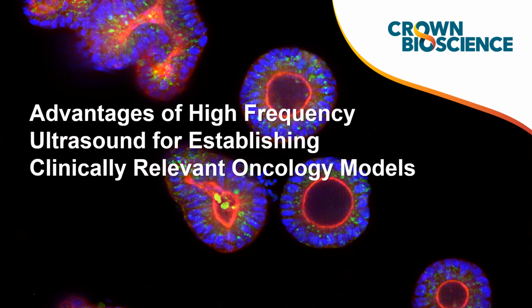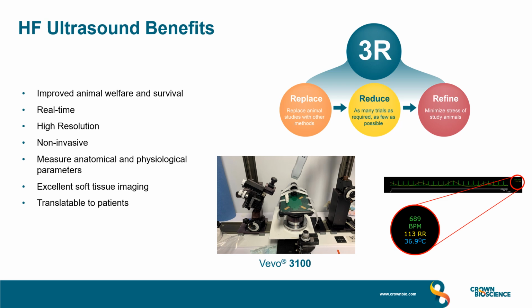In the next section of the talk, I want to focus on the advantages of using high-frequency ultrasound for establishing clinically relevant oncology models. So high-frequency ultrasound has a number of benefits. It leads to improved animal welfare and survival. It allows tumor monitoring in real time. It gives you high-resolution images. It is non-invasive. It allows the measurement of anatomical and physiological parameters. It is excellent for soft tissue imaging, and the data is also translatable to patients.